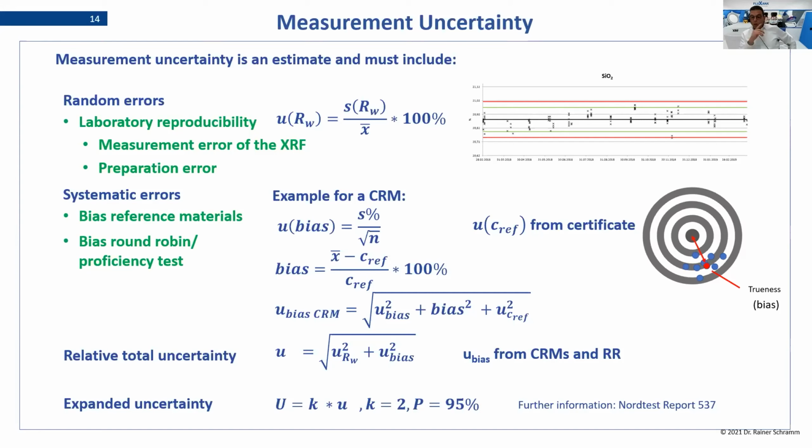There is another question. What about the reproducibility of the calibration? Is the reproducibility related to the uncertainty? So reproducibility means, by definition, that you remeasure a sample over a long time and with a lot of parameters you change, so that you include all the errors in that reproducibility.